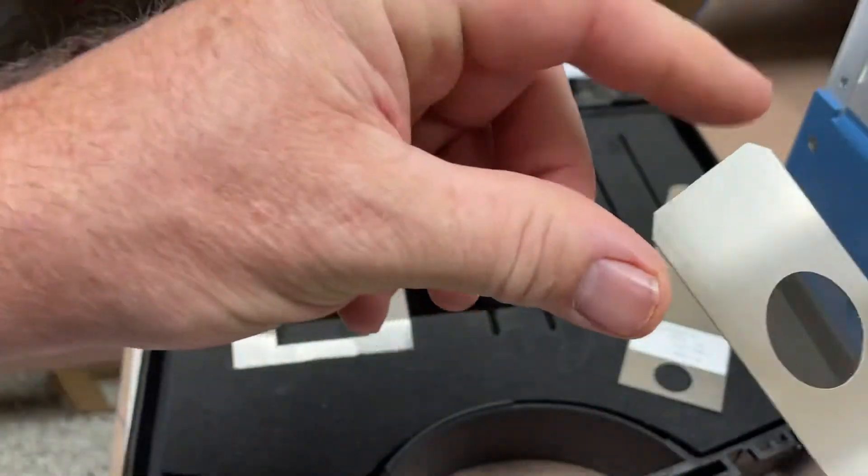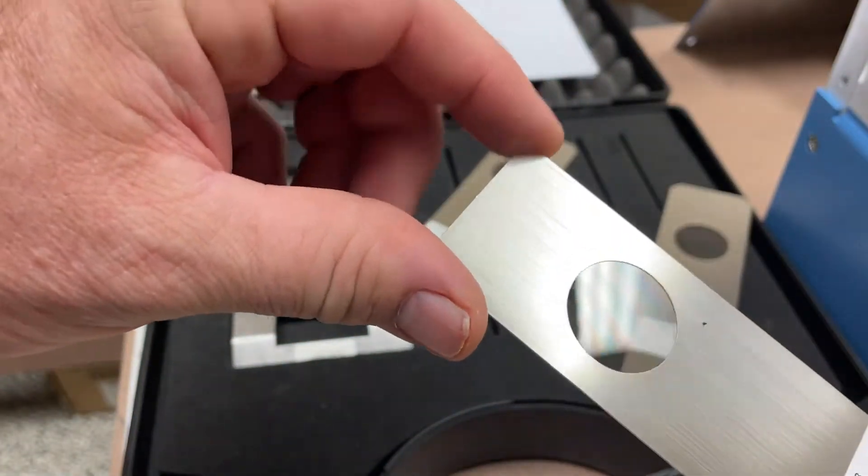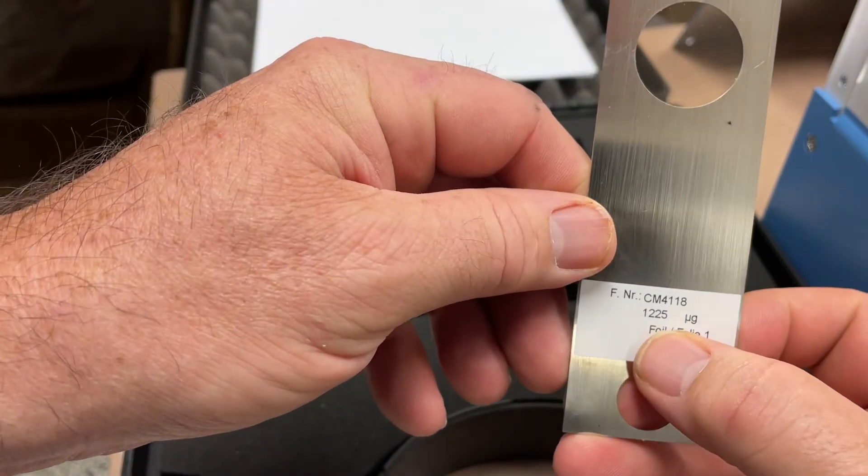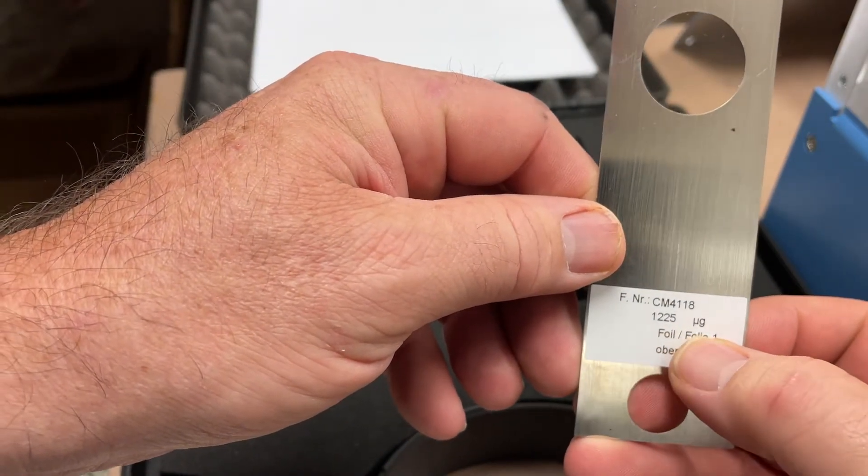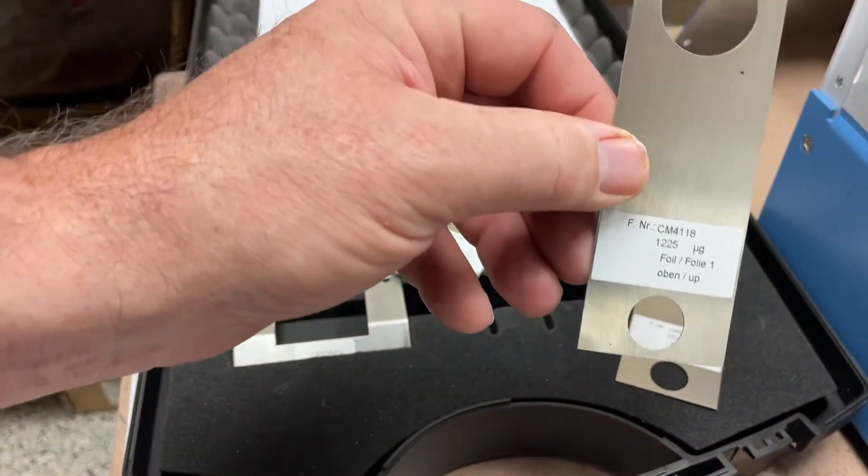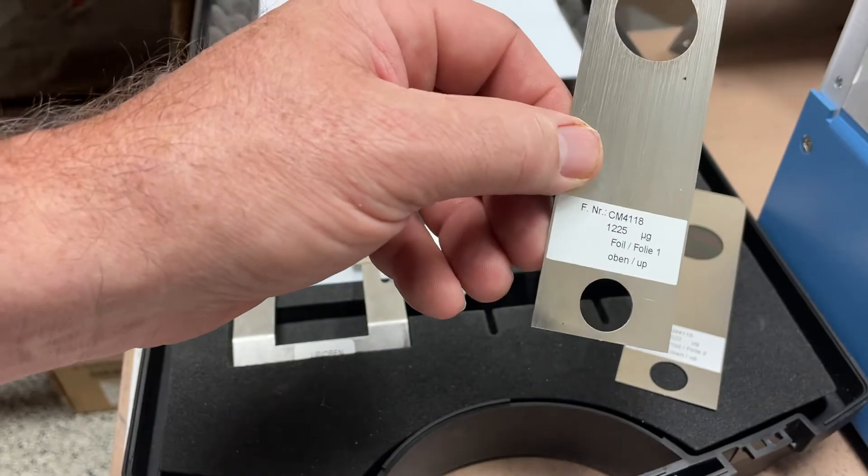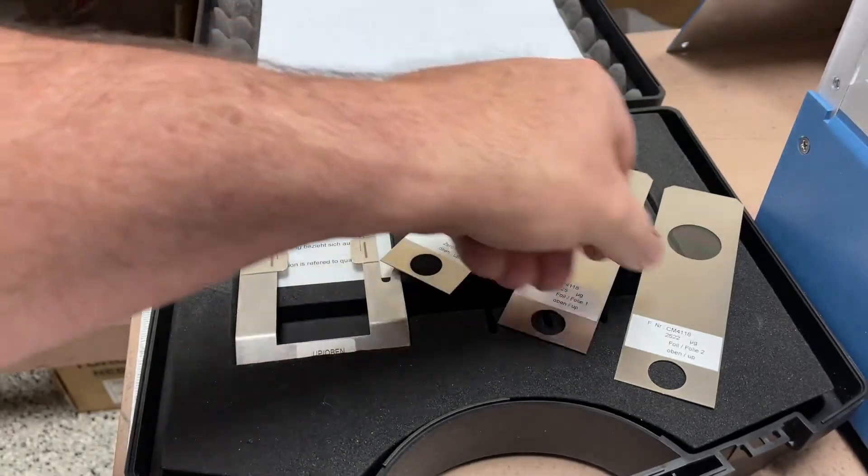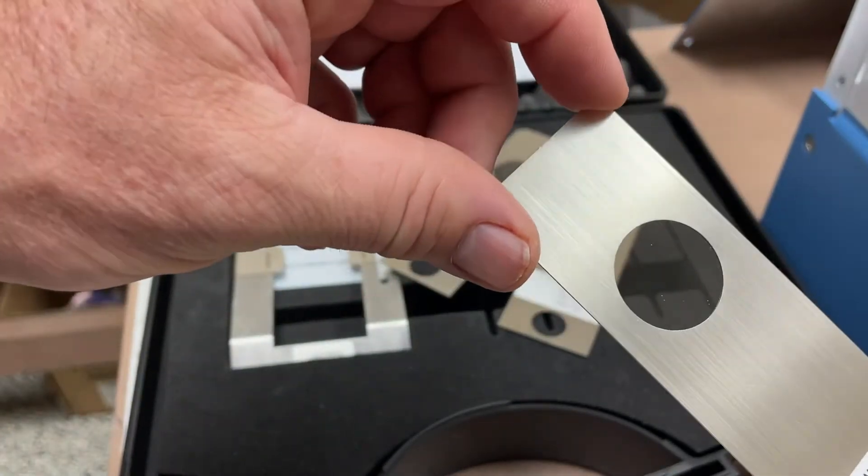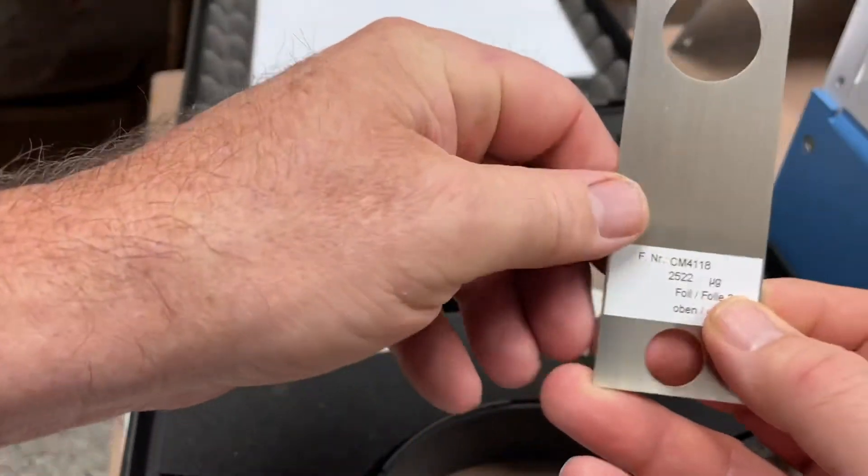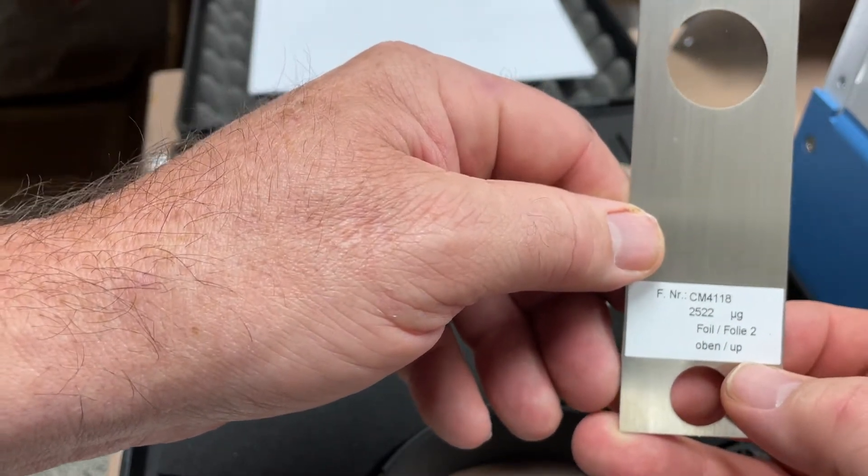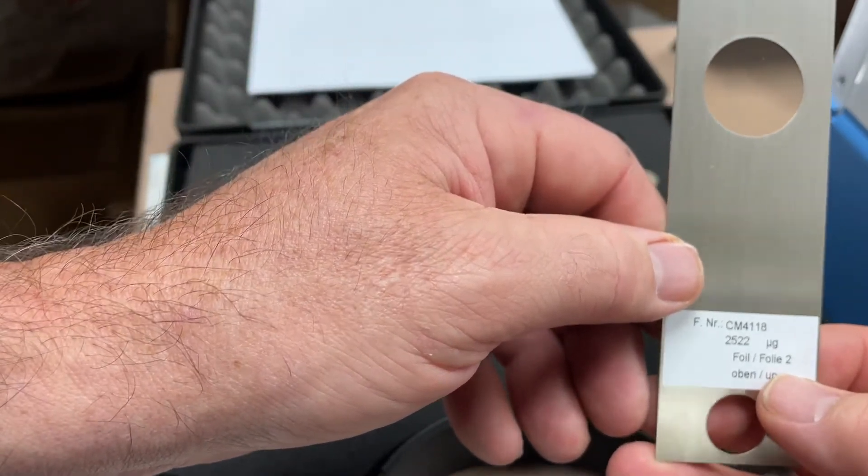The next one has a foil in this little circle and is labeled 1225 micrograms, so that's the number that should come up if the instrument is calibrated properly. The third one has 2522 micrograms labeled on it, so that's the number you would calibrate this foil to.